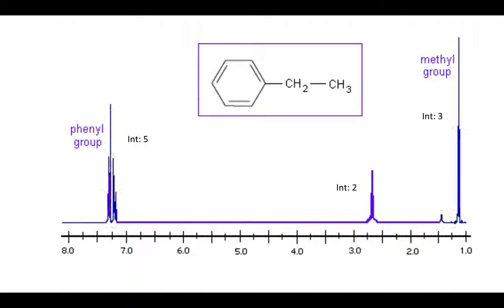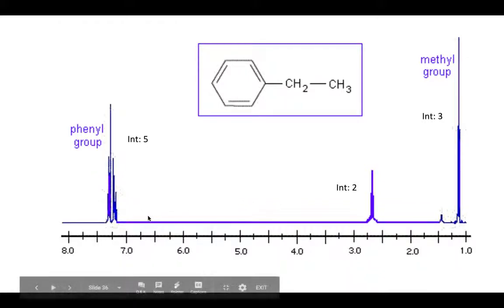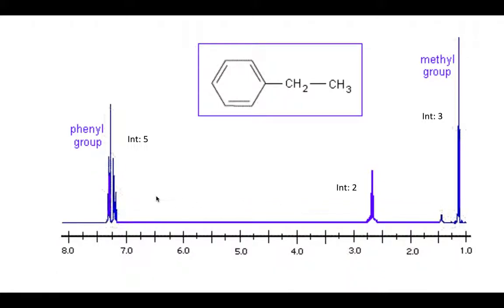One final example. Here we see ethylbenzene. We do see the benzene hydrogens here, here, here, here, and here, much farther downfield. Benzene hydrogens kind of show up down between 7 and 8 somewhere. So we can tell just by where they are on the axis that they are benzene hydrogens. We don't have to know anything special about it. We just look at our list of chemical shift values, and the only thing you're going to see between 7 and 8 like that is these benzene hydrogens.